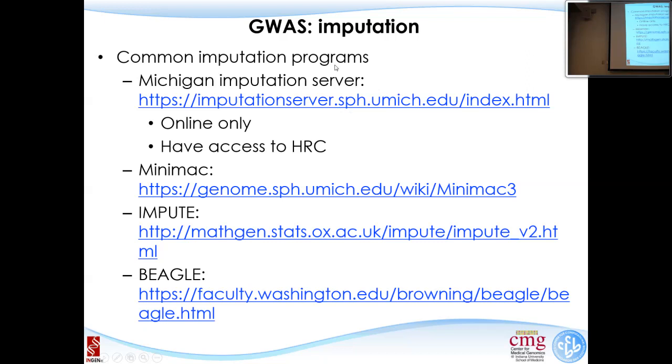If you cannot send your data out, you can always download standalone programs. The downside is that you can only use the 1000 Genomes. All these programs are very easy to set up. They can take either PLINK format or VCF format. Of course, you need to figure out what program parameters you want to use, which is sometimes a challenge.